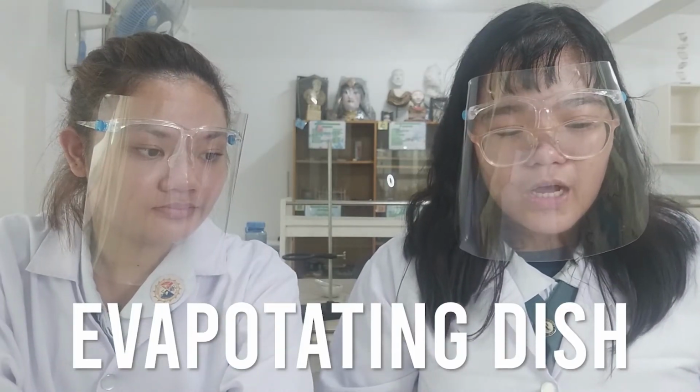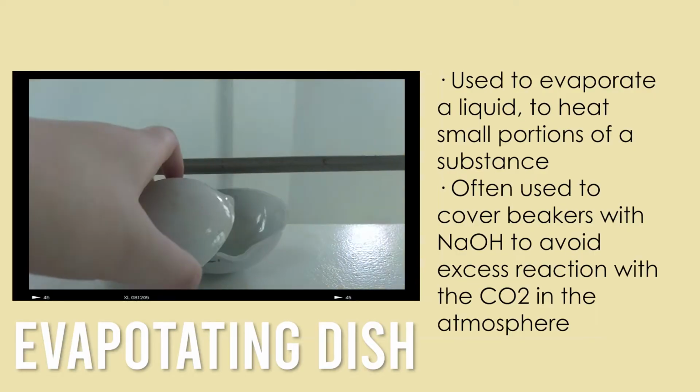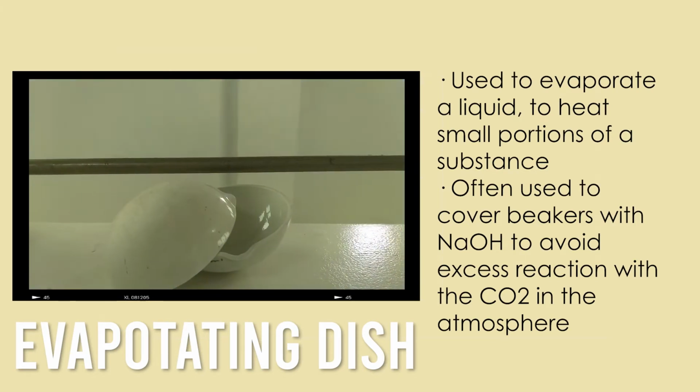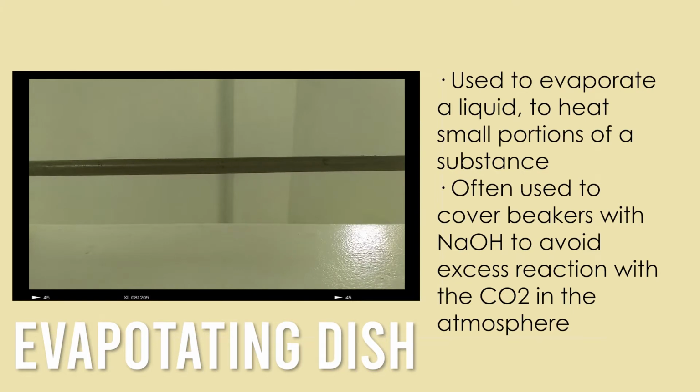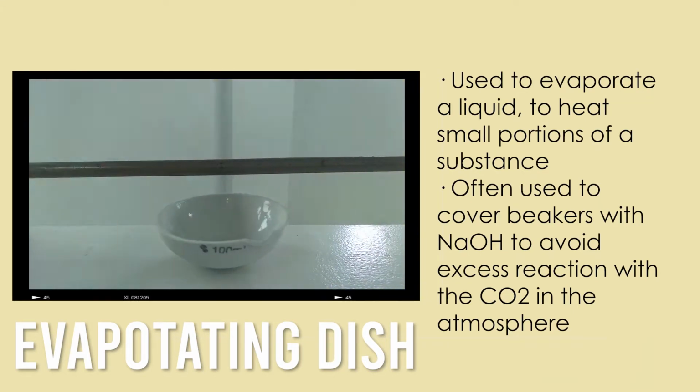The next one is the evaporating dish. This is another lab equipment that is used to evaporate a liquid, to heat small portions of a substance, and is often used to cover beakers with sodium hydroxide to avoid excess reaction with the carbon dioxide in the atmosphere.